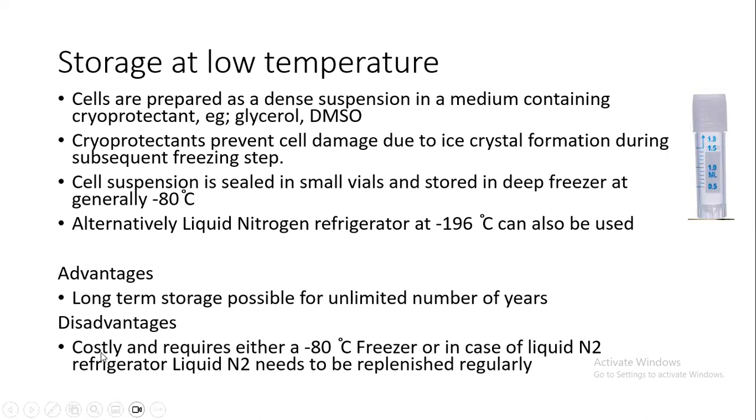Disadvantages are that, especially if you're using a liquid nitrogen refrigerator, then you need to replenish the liquid nitrogen at a regular interval, so that becomes costly. And also a minus 80 deep freezer you need, otherwise if you're not using a liquid nitrogen refrigerator, that is also costly. So these are the disadvantages.